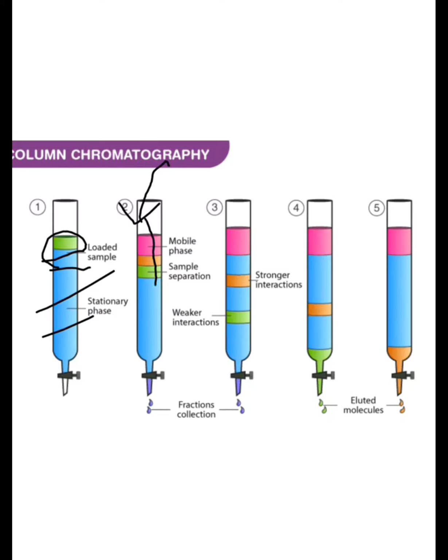The mobile phase moves towards the sample and further to the adsorbent, and the fraction is collected here. While the mobile phase is added, the samples get dissolved in it and different bands are formed in the adsorbent area.